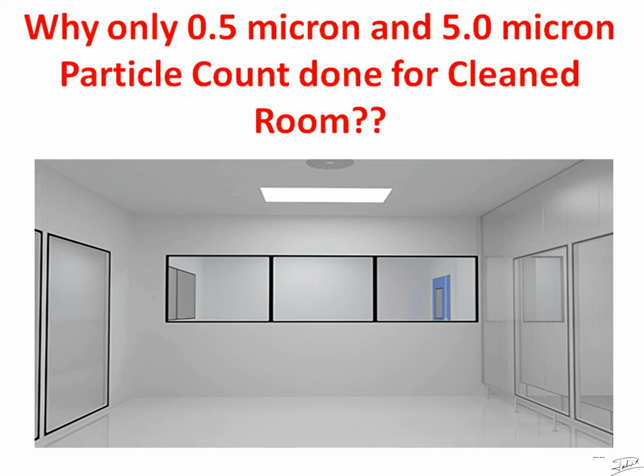So one question may arise: why only 0.5 micron and 5 micron particle counts for a clean room? This is a very crucial question. Why only 0.5? Why not other sizes like 0.1 micron or 0.3 micron or 10 micron? Why not those particle sizes? So we'll learn about that.